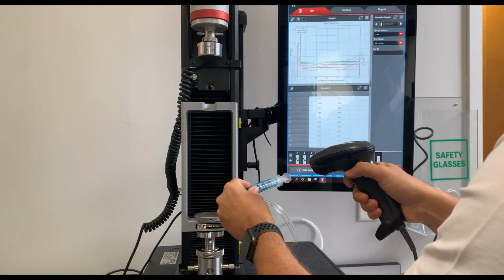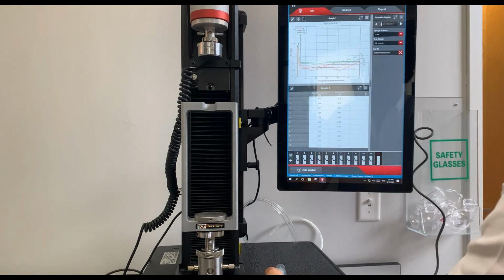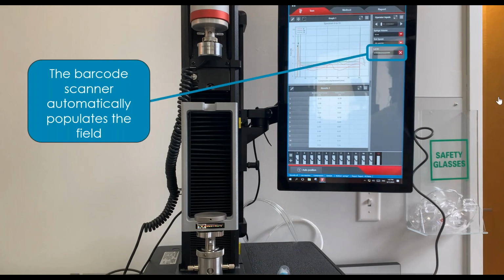So you see here, scan it, and it immediately populates the lot ID. And as you can see, this would be a very tedious and time-consuming string of numbers to have to type in every time.